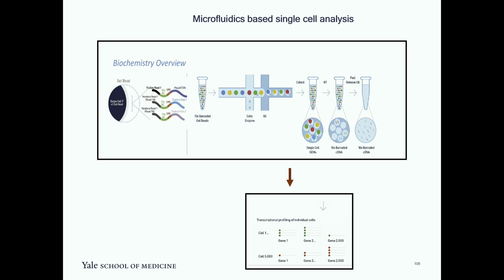In this process, at the junction where these inlets come together, they make an oil droplet, and the pressure is controlled in such a way that each oil droplet will have one bead, one cell, and all the reagents required for RT-PCR. Might not be the case, actually. A lot of droplets will be there where there might not be cells, where there might be two cells. Everything will not be... That's where I will come to, how that is handled.